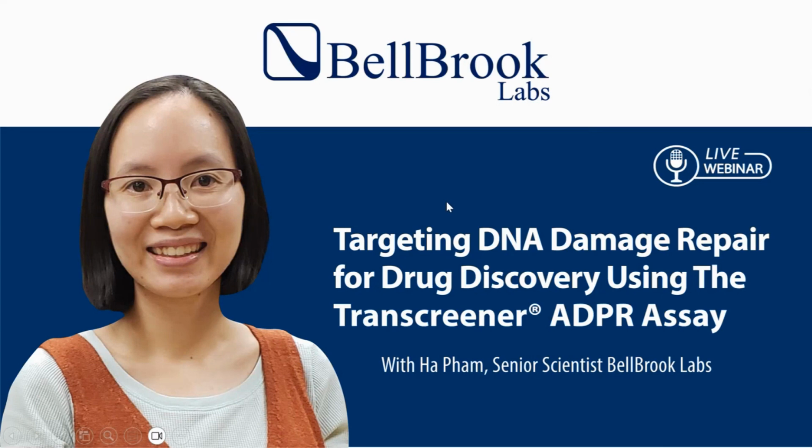Thank you, Justin, and thank you everybody for being here. Today's topic is going to be targeting DNA damage repair for drug discovery using the Transcreener ADPR assay.